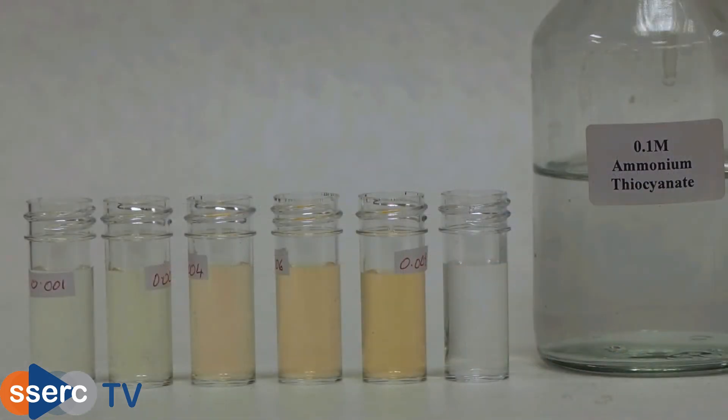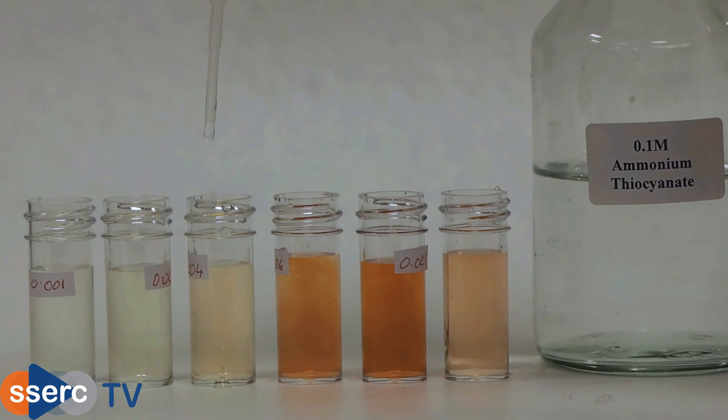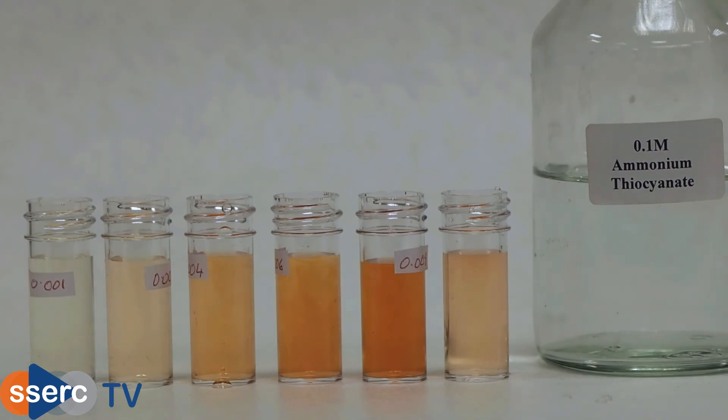Once that's done, we add 0.5 cubic centimeters of ammonium or potassium thiocyanate solution to each of the standards and to your tea sample. Thiocyanate ions form an intense red colored complex with the iron three ions, which makes it much easier to determine the concentration.